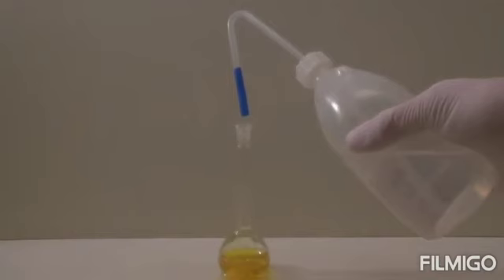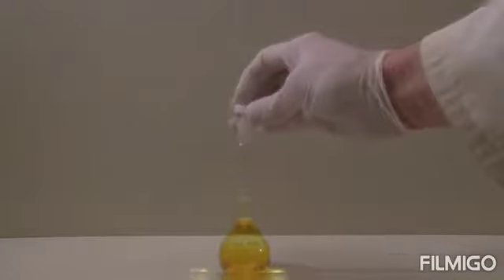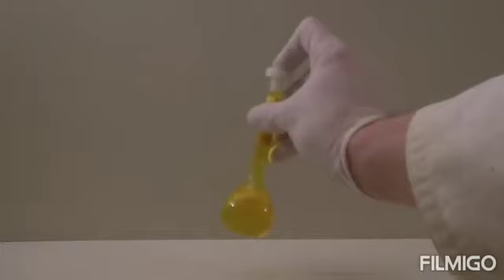After dissolution of each and every reagent added into the flask, add distilled water to make up the volume up to 50 ml. Then stopper the flask and shake the flask carefully for the uniform mixing of all the reagents.